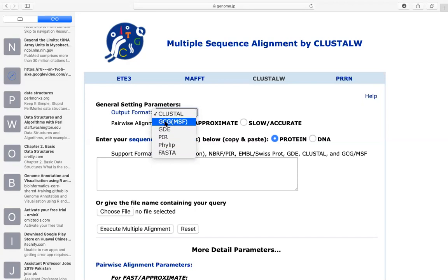The most popular format is FASTA. We have talked about the FASTA format in past lectures. It is widely used and accepted by every software, so you should choose FASTA format. The second thing is, in pairwise alignment settings, you want to select fast/approximate or slow and accurate. These are two types of options: fast gives results quickly but they are approximate, not accurate.